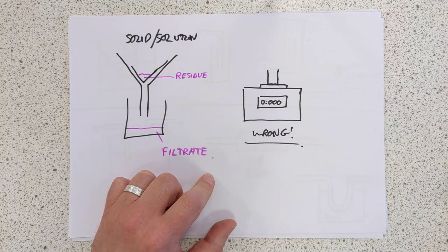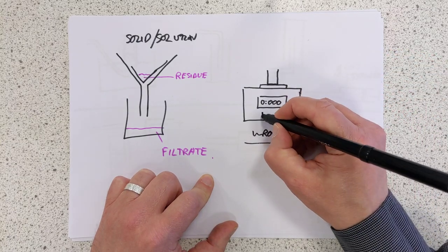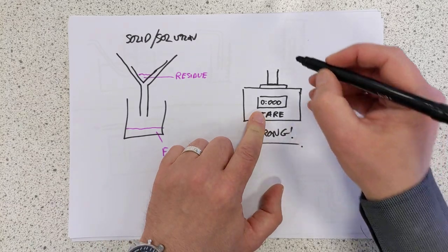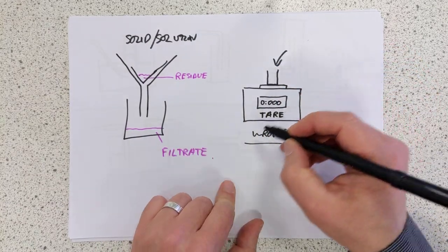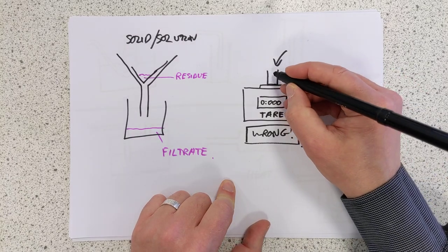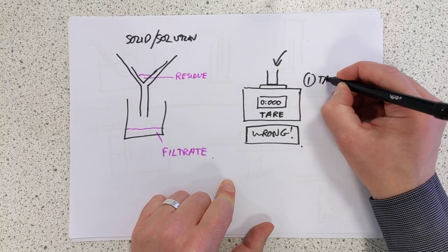Using a balance, many people will pop an empty beaker on a scale, for example, press the tare button, T-A-R-E, which is the zero button, and put it to zero, and then start adding their chemicals. This is wrong. What you should do is tare the balance first.